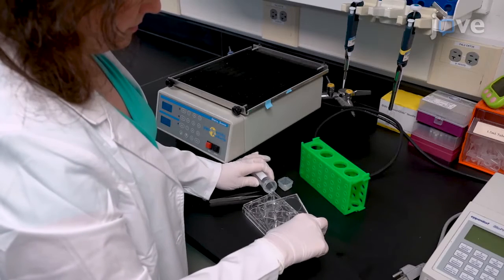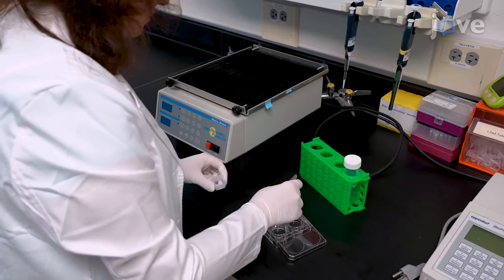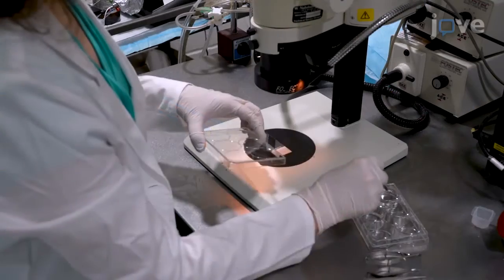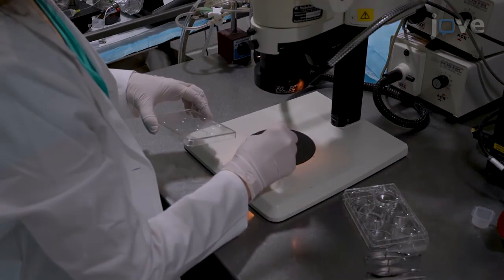Begin by thawing and rinsing the tongue in 0.1 molar phosphate buffer. Then place one half of the anterior tongue containing the fungi.